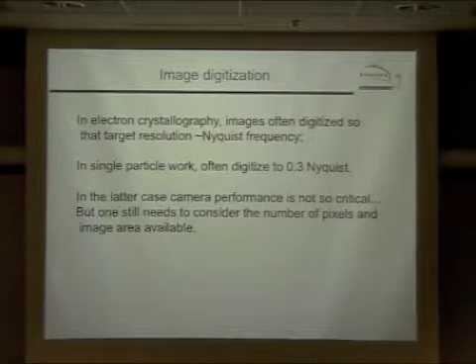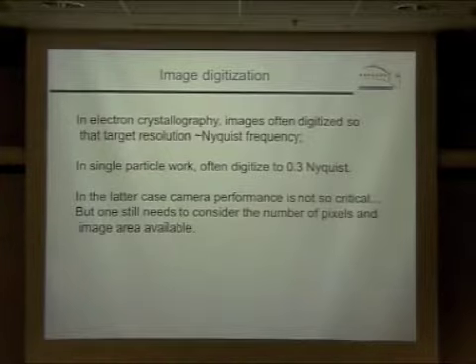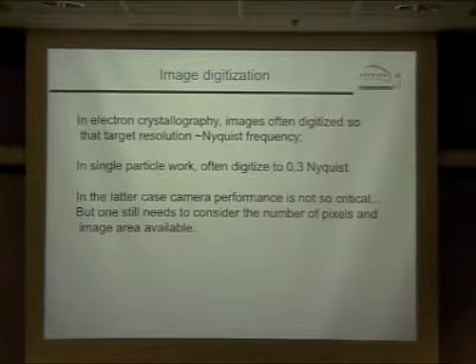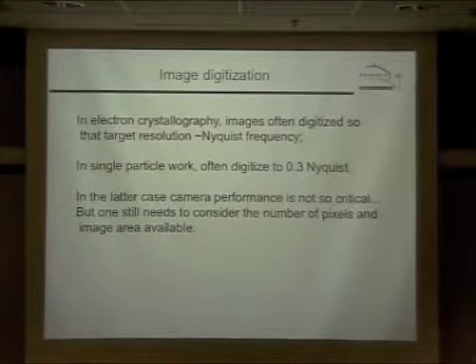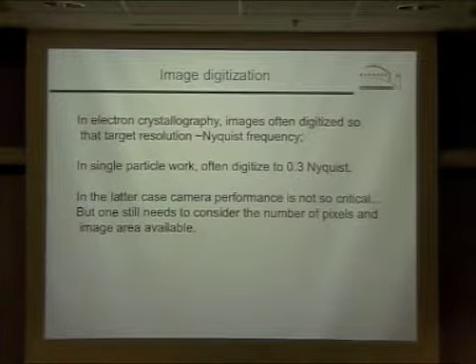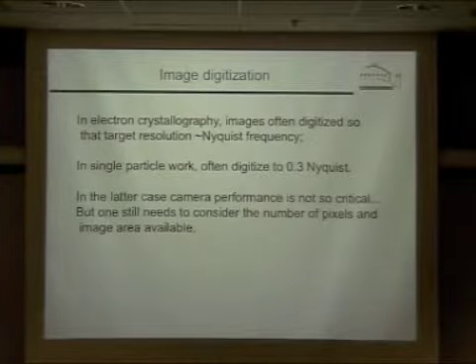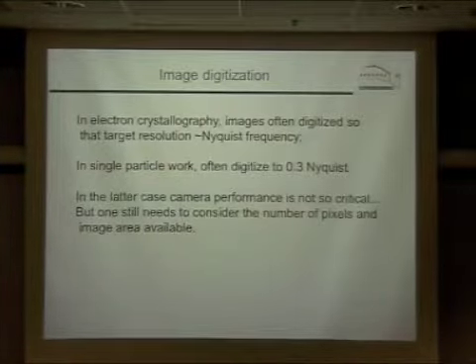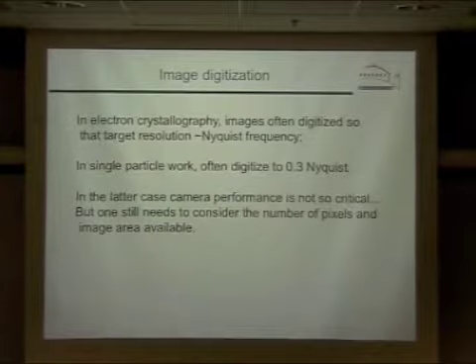So this developed because Richard Henderson, I guess, had pointed out that at least in cases where you're limited by computing power, it's better to digitize the image right out to the Nyquist limit than to digitize so that you're just using a smaller fraction of the Nyquist limit, and therefore you're constrained to digitizing smaller areas of the crystal. Better to digitize the whole crystal with just enough resolution to get to the Nyquist limit.